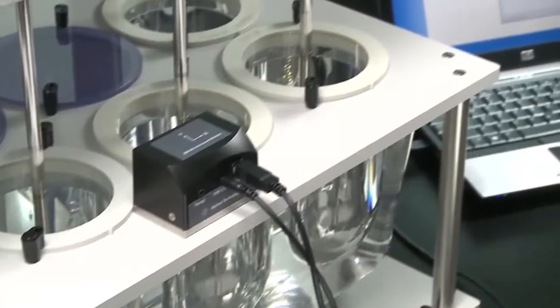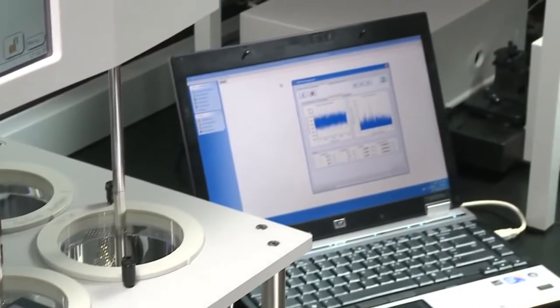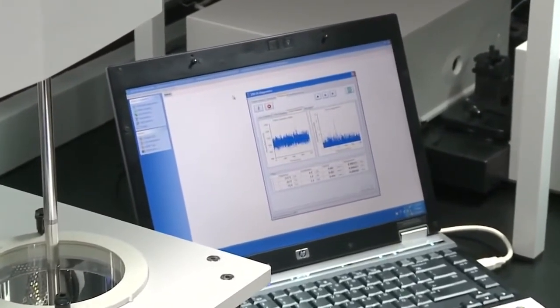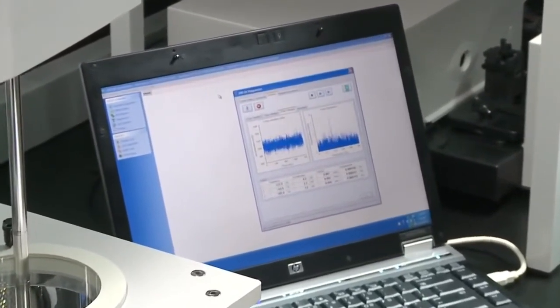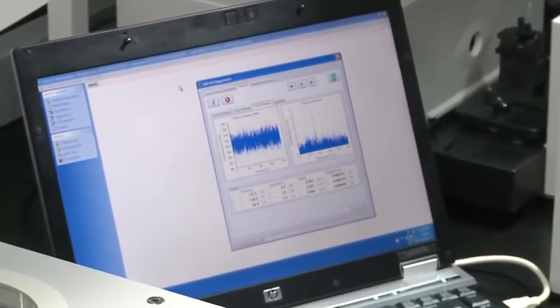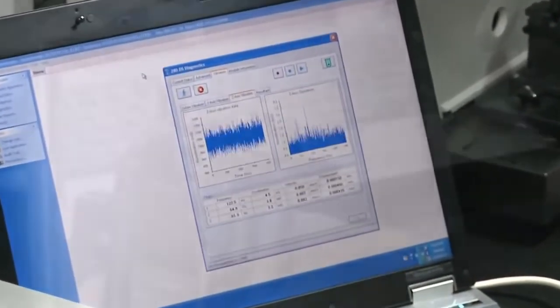The 280DS can also take vibration measurements, including a time weighted average, to pinpoint environmental problems that could affect dissolution results.